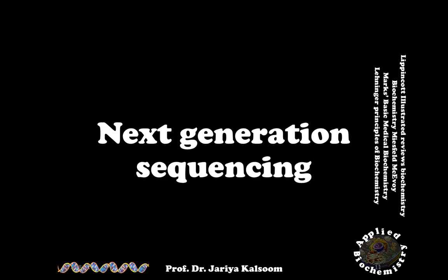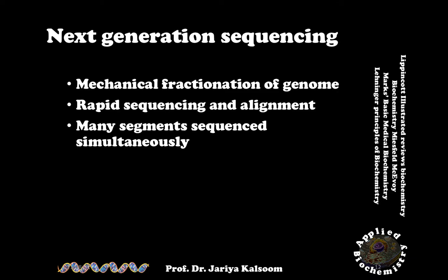The main limitation of the Sanger dideoxy sequencing method is speed. Improvements in this technique have led to next generation sequencing, which allows the whole genome to be sequenced in one day. It involves mechanical fractionation of the genome followed by rapid sequencing and alignment. Many segments are sequenced simultaneously.